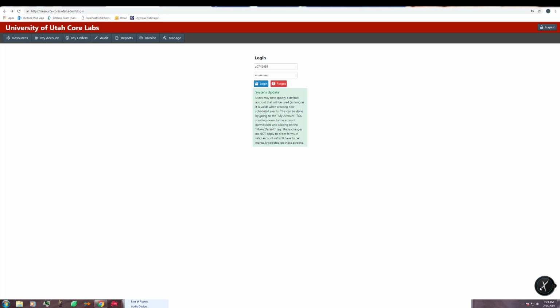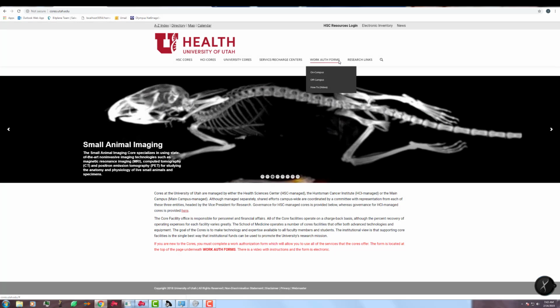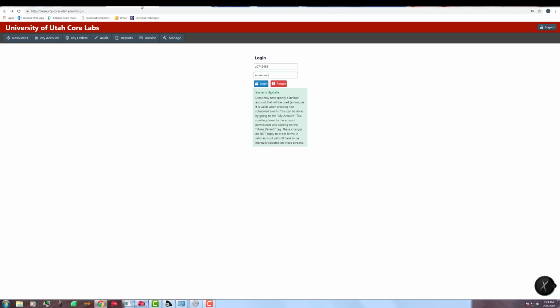First, to log in and gain access, you must have completed a work authorization form located on our main website at cores.utah.edu. It is under the Work Authorization Form tab. Once that has been approved and signed off on by your PI, you may log in.